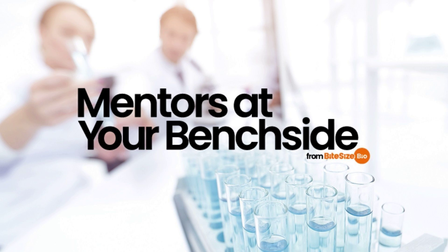Unfortunately, this causes crucial data to be lost. In fact, it's much worse than that. All data that contributes most to the final electron density map is lost. This is called the phase problem. It's not insurmountable, but we never get the data back. Instead, it must be estimated by a complex process of inspired trial and error and other clever methods.